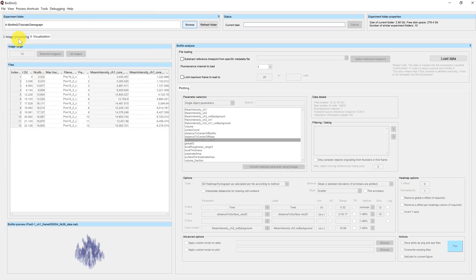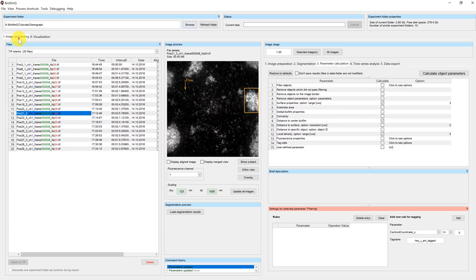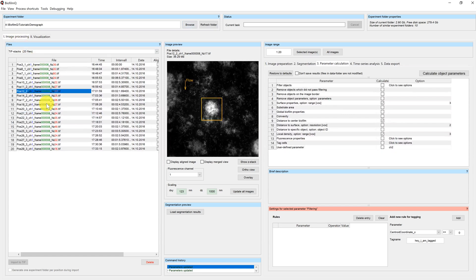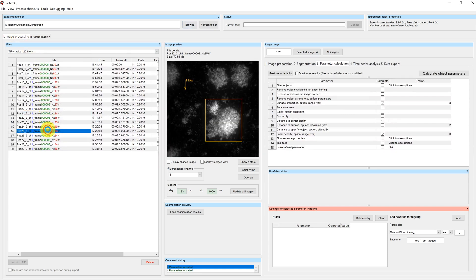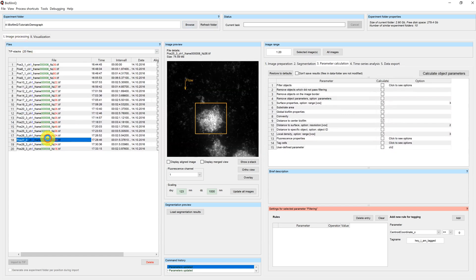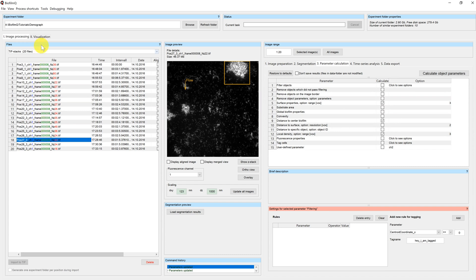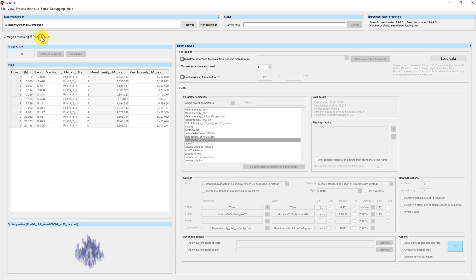And in this directory, you can see I have different biofilms. Now we will load all of these biofilms to our workspace for plotting.